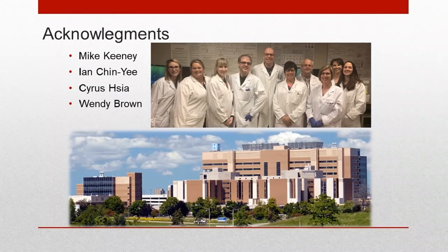That is not the intent of these tubes. I believe the legal disclaimer probably written on the package would say that this is for diagnostic purposes and not for doing MRD assessment. It's not to say that you couldn't use them, but it would then be an LDT. It wouldn't be an IVD test.